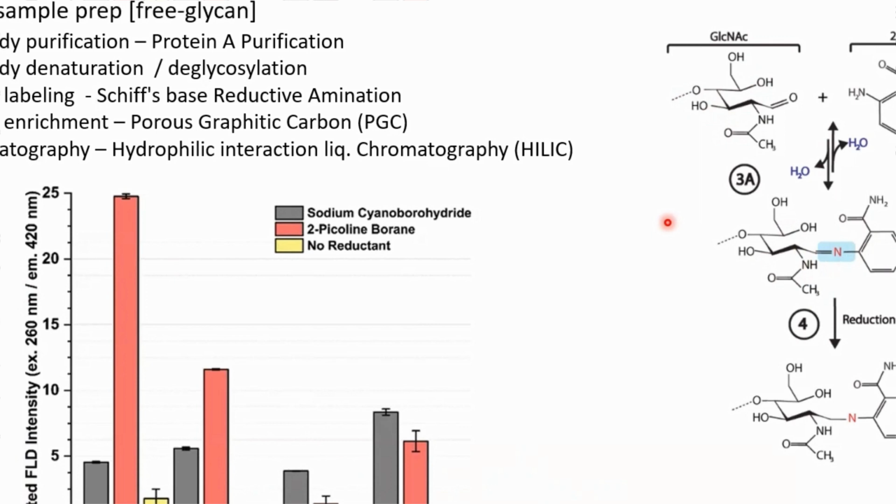This is something that's been tested before in literature, but we've never seen it done under non-aqueous conditions, as this reaction is usually done under aqueous conditions.